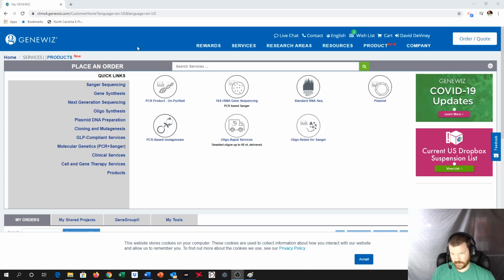And so what I did early on is I sent a couple samples off just to give it a try and make sure this was going to work, right? And so what you can see is in Genewiz, and if you want to go to this website, you certainly can. You're probably not going to be ordering anything, so you don't really need to know how to use this. But just as an example, what you can do at Genewiz is here I am looking at sequencing things. So we can sequence PCR product that is not purified, right? Which is what we would have ended up doing.